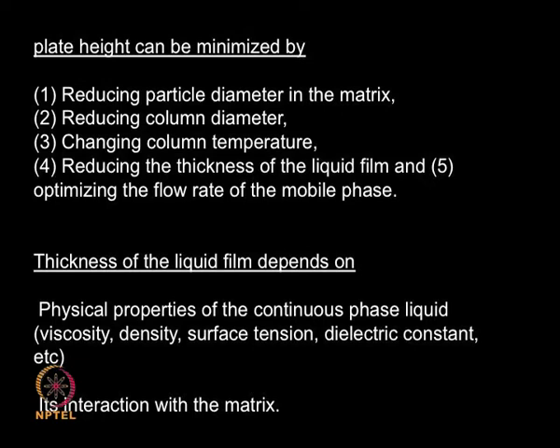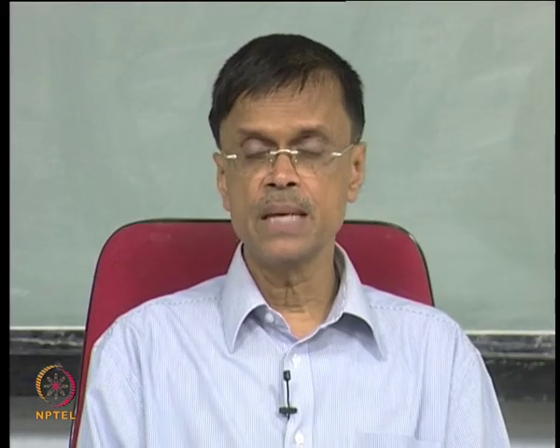Now, any particle present in your stationary phase is going to be covered by a liquid film. This liquid film is going to be dependent upon the physical properties of this continuous phase liquid, like viscosity, density, surface tension, dielectric constant, so many factors actually. This liquid film is going to offer some resistance to the solute that is going to attach itself to the stationary phase. So, smaller the liquid film, faster will be the attachment, that means the resistance will be less. Bigger the liquid film, resistance will be more.